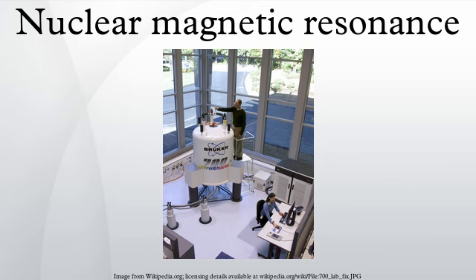See also Earth's field NMR. Makers of NMR equipment. Major NMR instrument makers include Magritek, Oxford Instruments, Bruker, Spinlock SRL, General Electric, JEOL, Kimball Physics, Philips, Siemens AG, and Agilent Technologies, Incorporated.